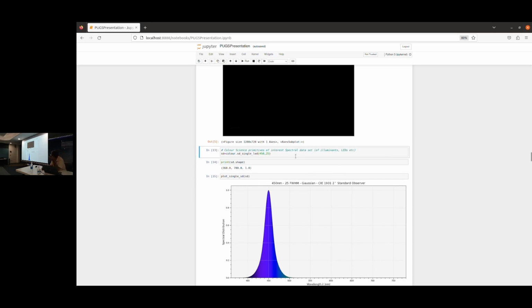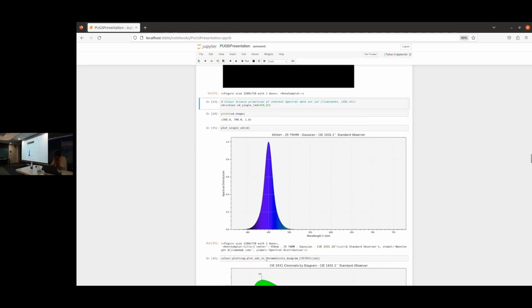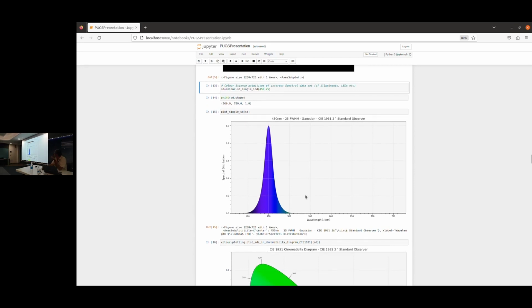So in this case, I synthesized a blue LED at a wavelength of 450 nanometers, which is bluish, as you can see over here. And LEDs, unlike lasers, have a slightly broad response, right? The wavelengths have a spread. It's not very sharp, unlike a laser. So if you look at an LED data sheet, it will give you a number around 20, 25, 30, so somewhere around there. So I've just used it. For this primitive, it's a Gaussian profile. And if you put this to a spectrometer and capture the data, this is how it will look, roughly.